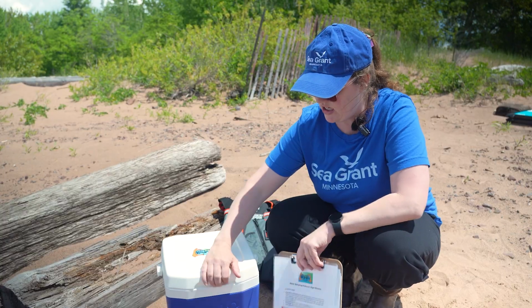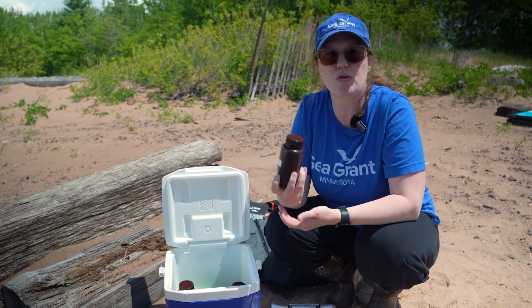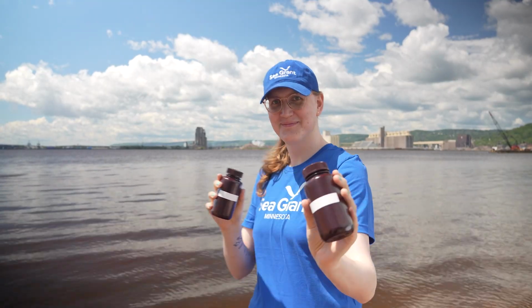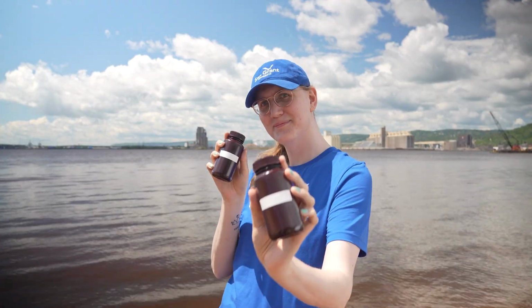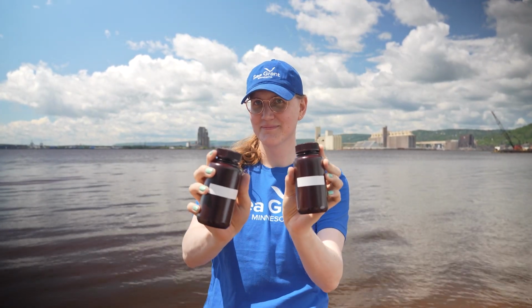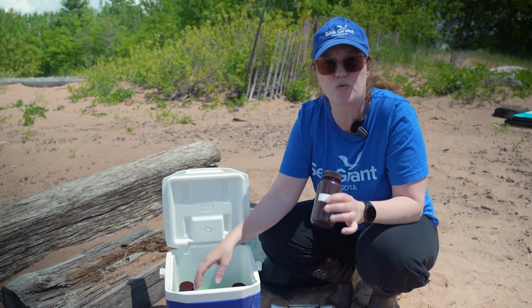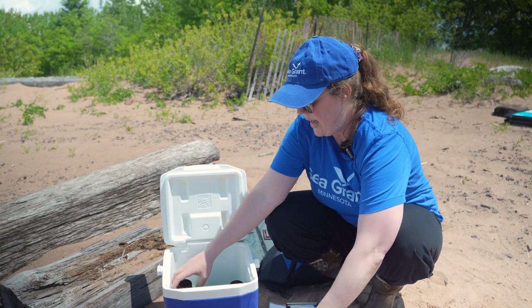So this is your kit. Inside you will find 6 of these 250 milliliter amber bottles. The reason we use these amber plastic bottles is to keep sunlight out, to slow down biological productivity once the water sample has been collected. So this is what you will use to actually collect your sample of water.